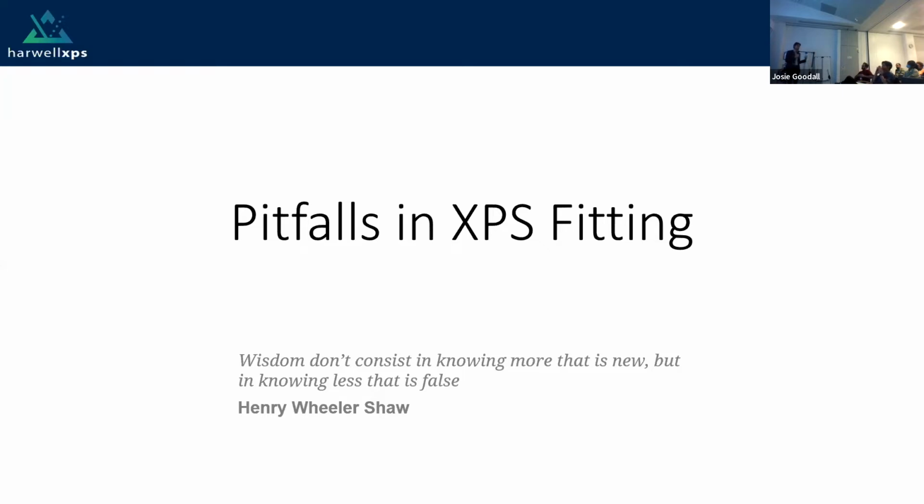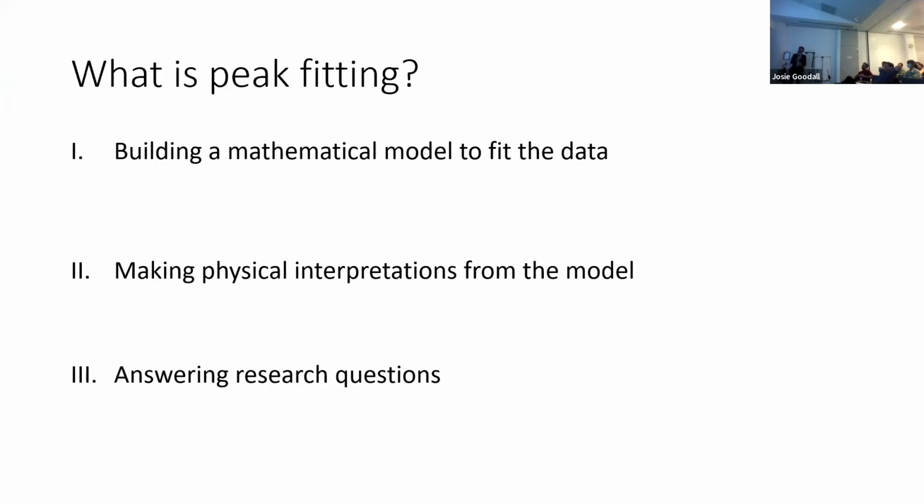This is a major problem in our field, so I'm going to have a run through, in a light-hearted way, but hopefully with a serious message as well, of things that people might get wrong. There are going to be a lot of examples. If your data appears here, I apologize. I hope not. That's going to be embarrassing.